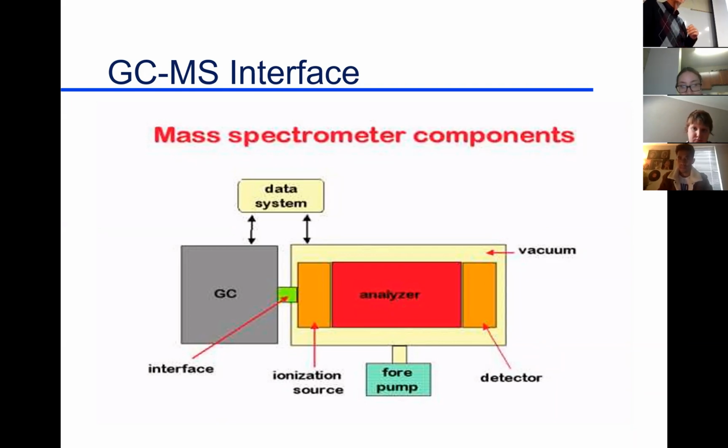But we do like to interface these with tools that do separations for us. When we start putting mixed compounds into a mass spectrometer, our data are a bunch of mixed fragments, and it's hard to say where they come from, and there are multiple molecules. So we really like to tie a mass spectrometer into some means of separation. So let's separate a mixture into components and then get our mass spectra so we get each component. Much better success in terms of identification.